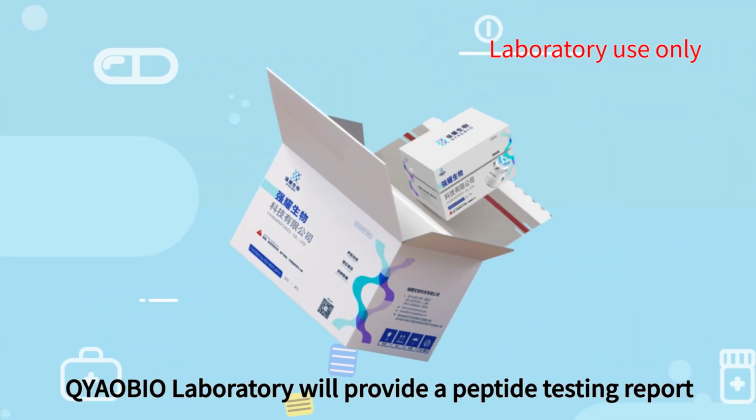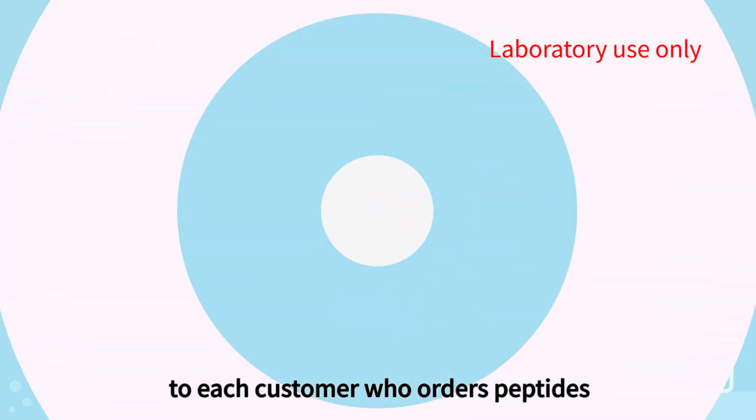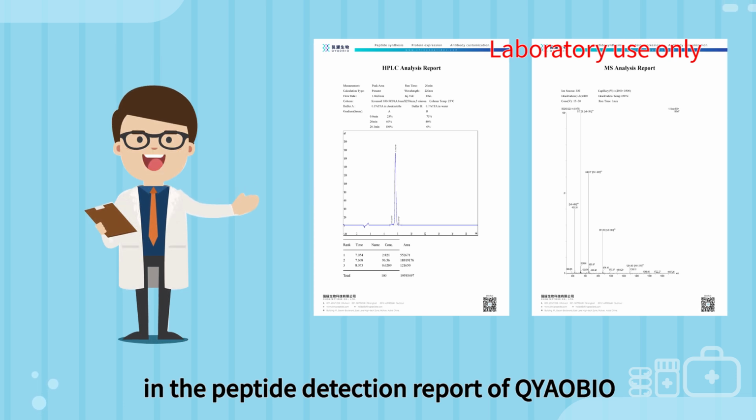Usually, Qiangyao Laboratory will provide a peptide testing report to each customer who orders peptides. In today's video, we will talk about how to understand the charts in the peptide detection report of Qiangyao Biotechnology.